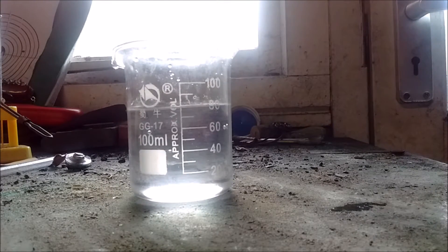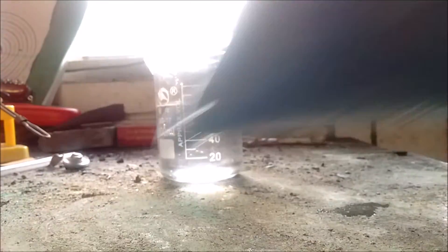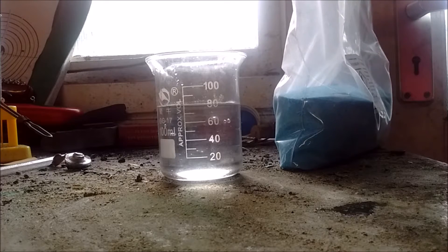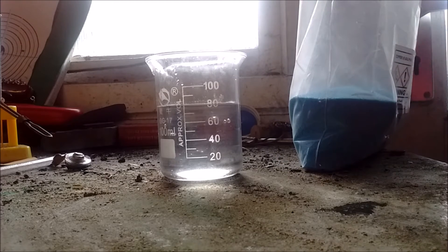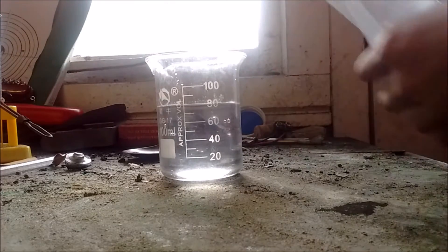It doesn't have to be distilled water. If you want a purer result it probably should be, but I don't have any distilled water so this is just normal water. Next thing you want: copper sulfate. As you can see on the label, don't pour it into streams or eat it. But it's such a common chemical — you go to anything scientific and they will literally hand out party bags of the stuff. You can buy it off Amazon. It's ridiculous.